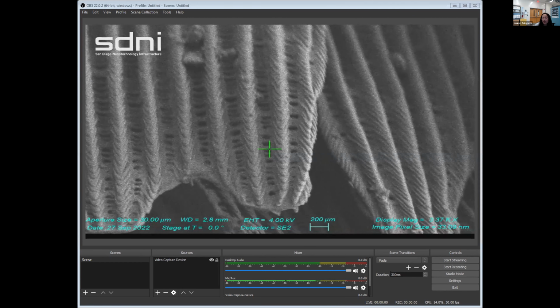In the case of the blue morpho butterfly, diffracted waves interfere with each other so that certain color wavelengths cancel out and aren't shown, while others are intensified. So the size and the shape of the gaps shown here, in between the individual small ridges, directly correspond to what wavelength and what color we see.